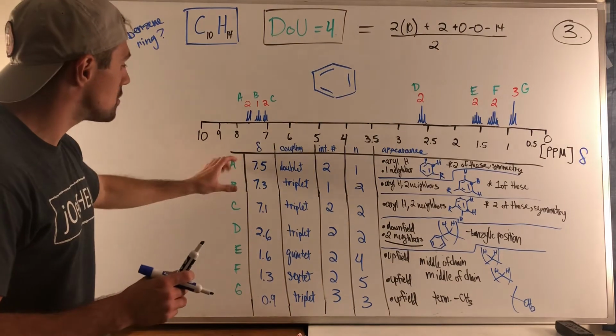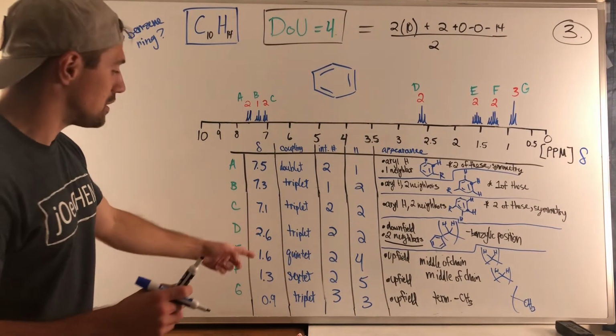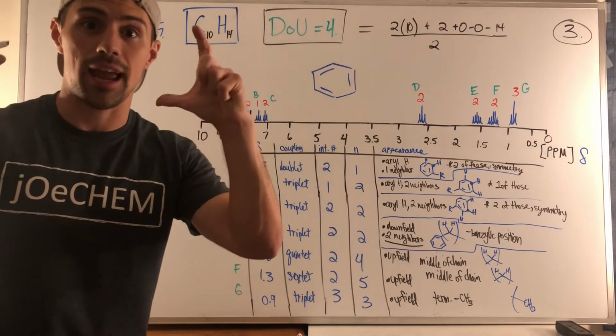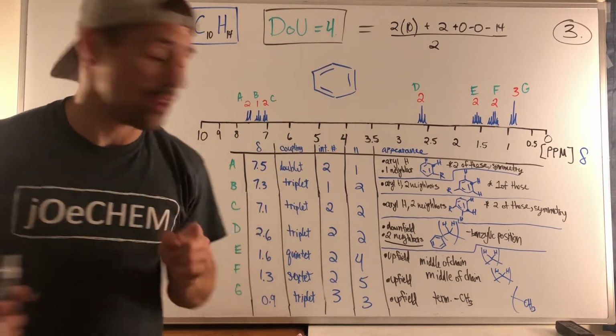And it makes sense because we can see these are very downfield. We see 1 carbon that's fairly downfield, but then that kind of tails off. So this 2.6 also aligns with being benzylic. If you check out a chemical shift table, make sure you have it handy. Don't leave your house ever without it, right?